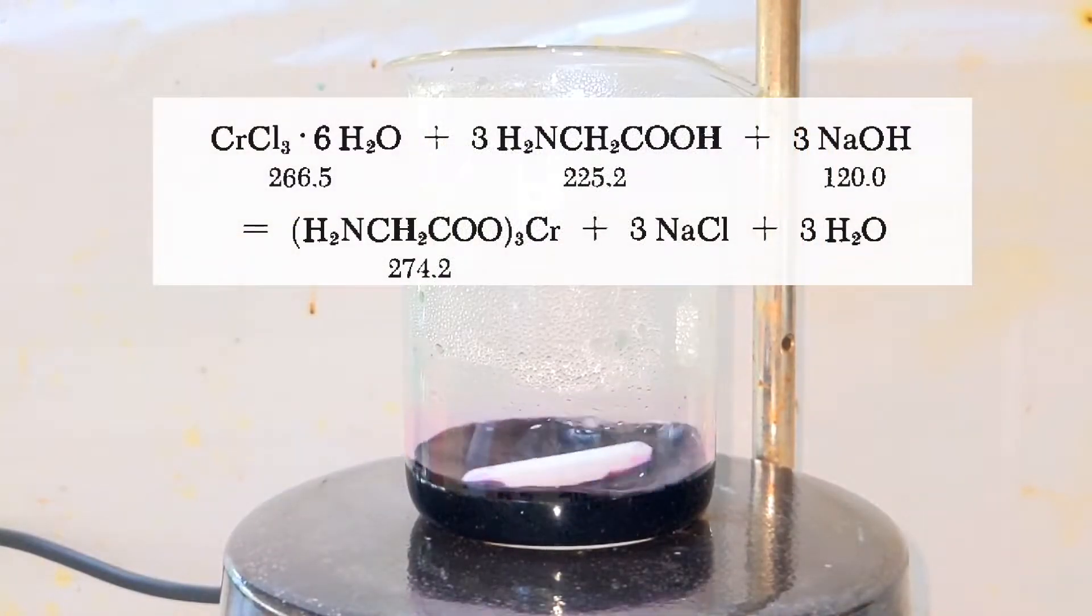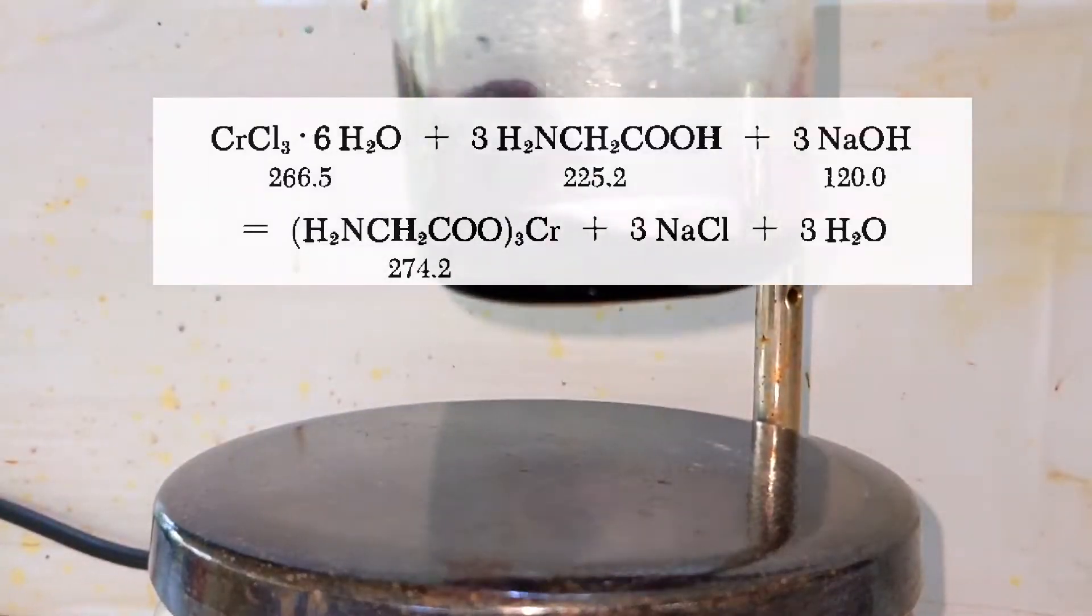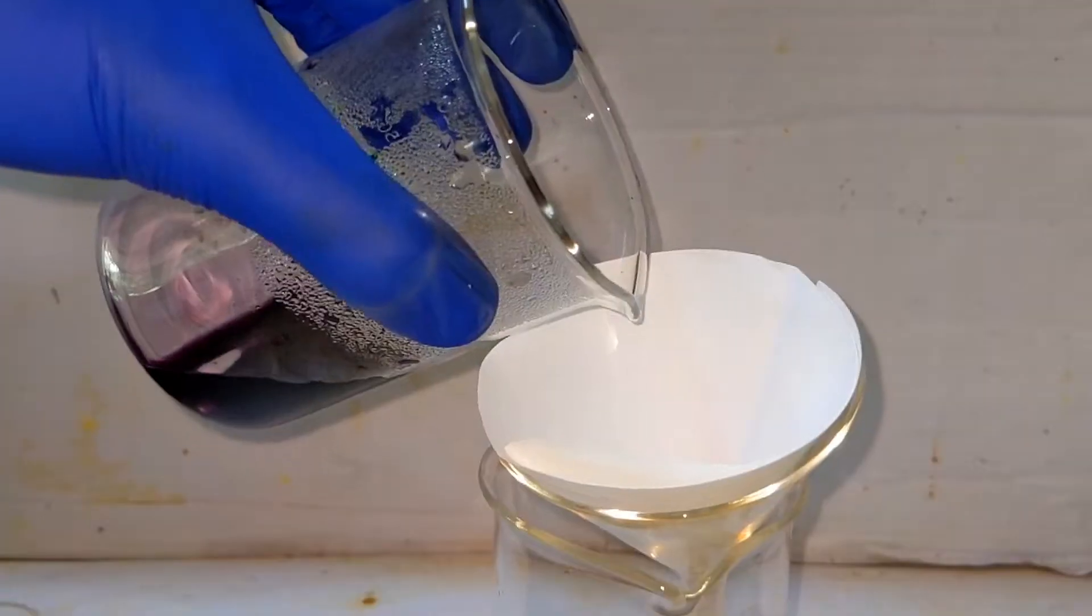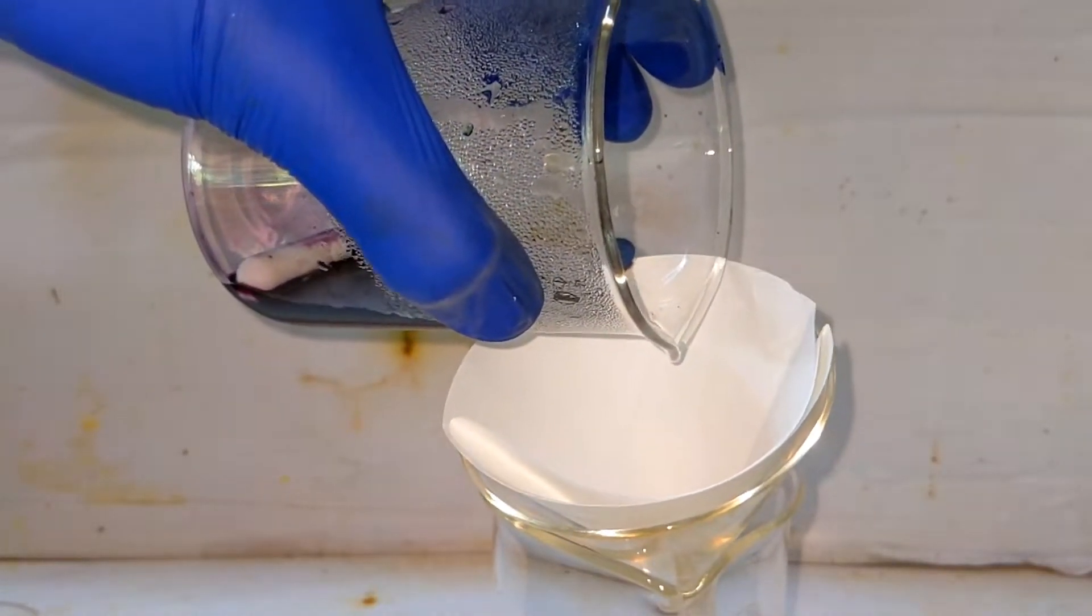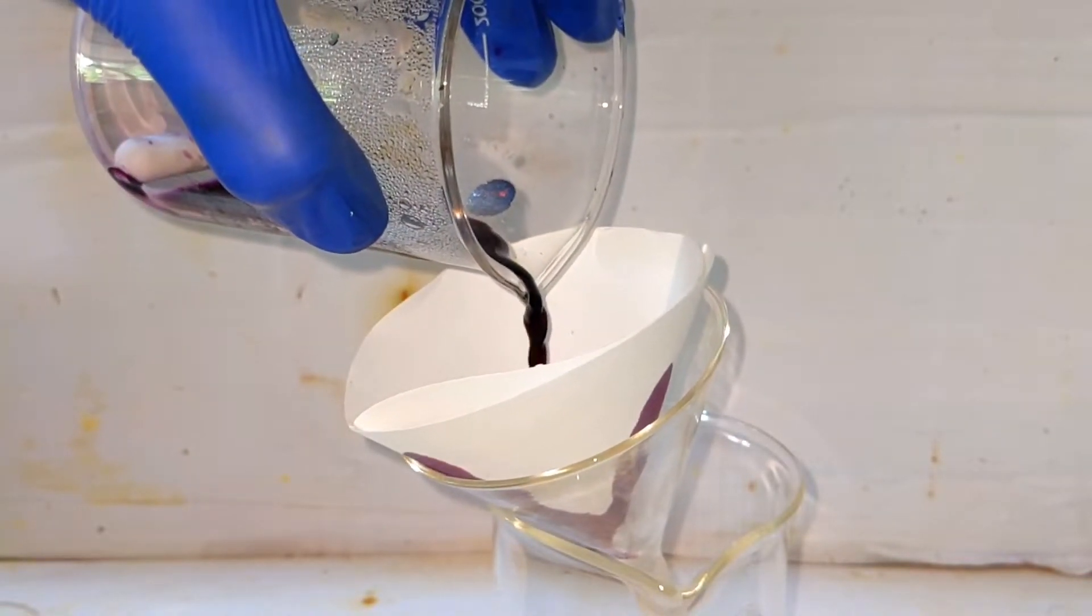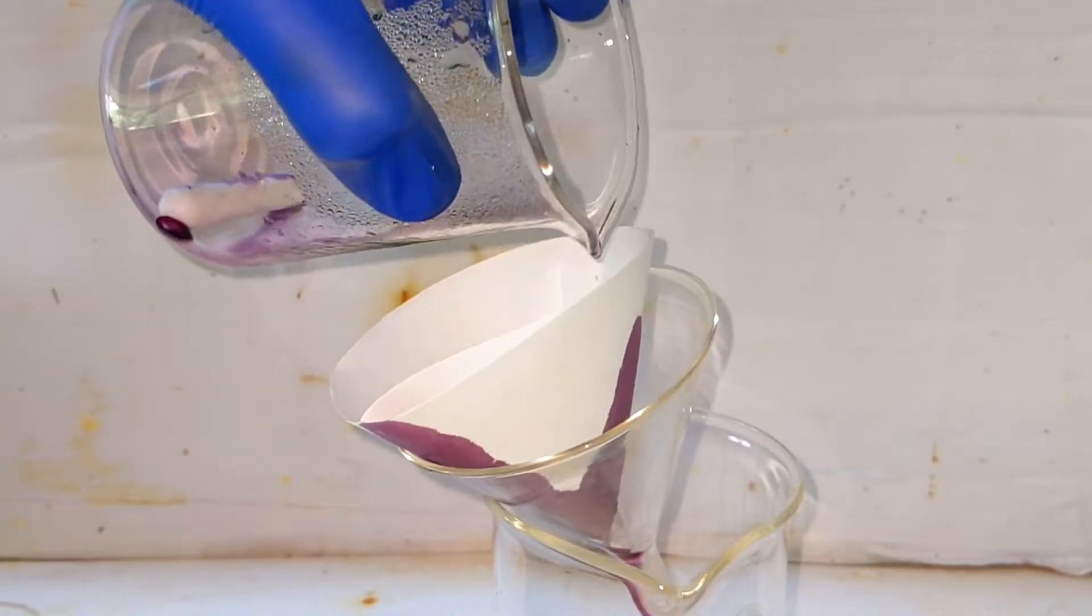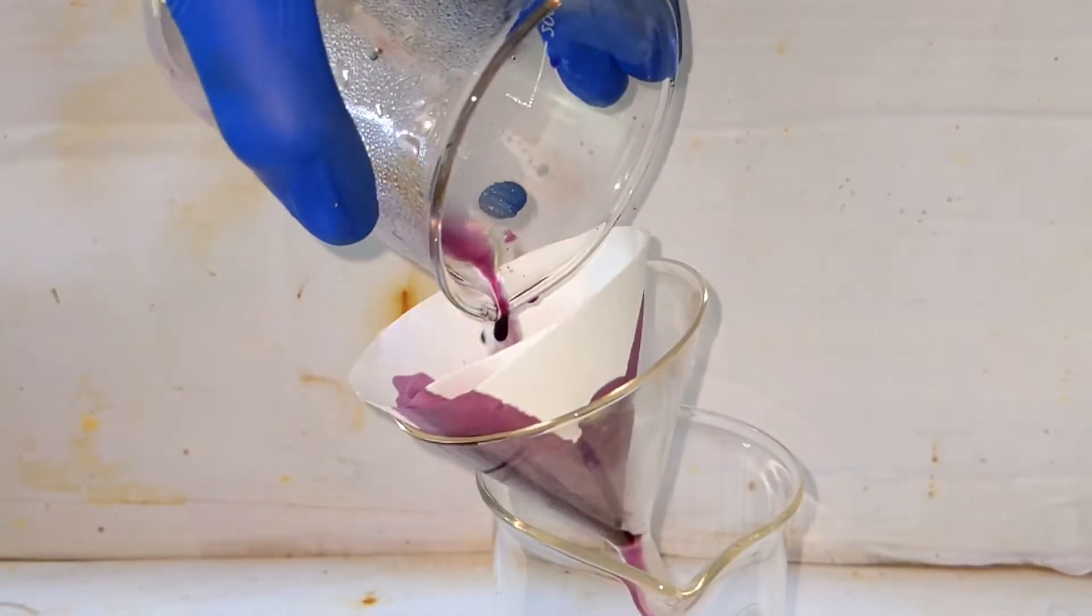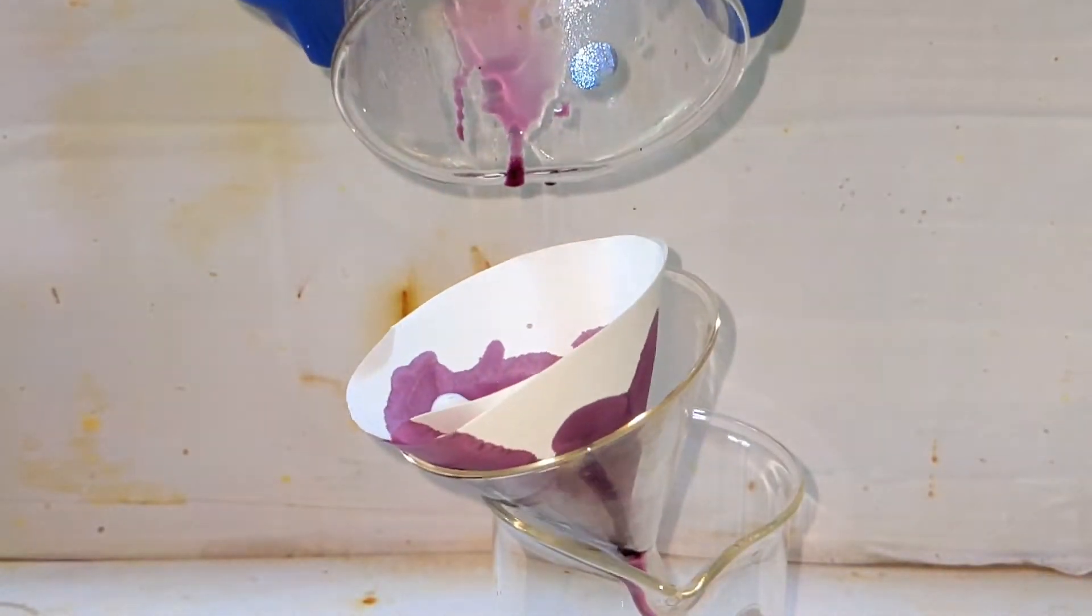What happened here is the chromium formed a complex with glycine, that is the chromium-3-glycinate. We have to filter the solution in order to remove any precipitate that has formed. According to the literature, a precipitate should be formed, but in my case I did not get any precipitate and the complete solution just filtered over into the receiving beaker.